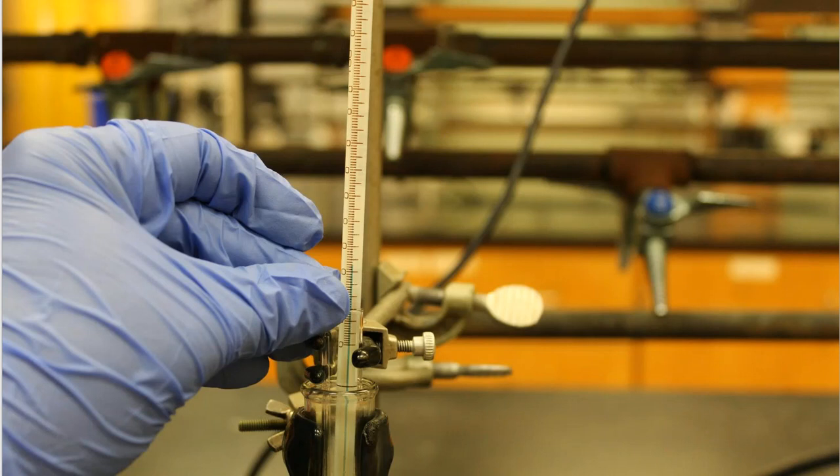The closed end needs to be pointed up. So in other words, I need to put that capillary tube in almost upside down compared to how we would put it into a melting point apparatus. So closed end points up. And then I've also put my thermometer into that test tube as well. And my liquid is eventually going to go into the test tube in addition to these two things. And then we begin to heat the Thiele tube. That's how this process works.